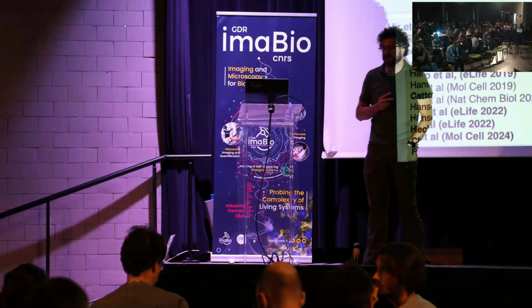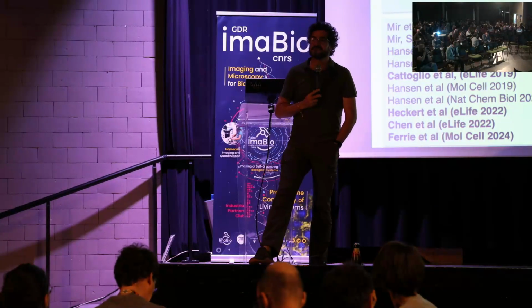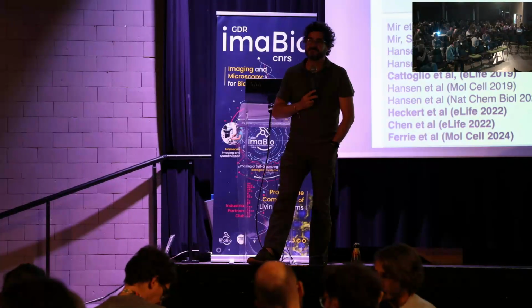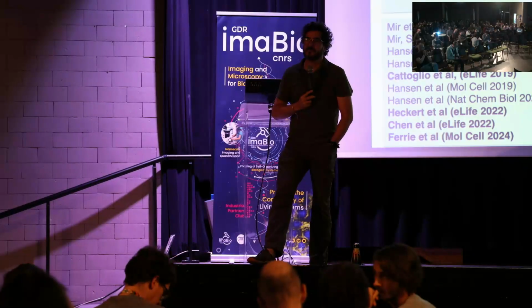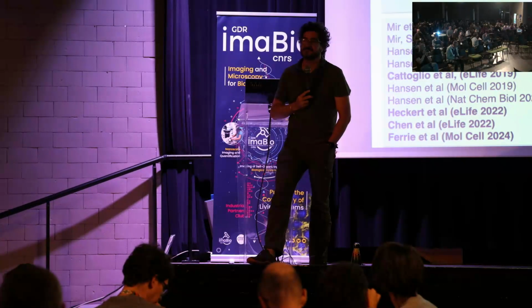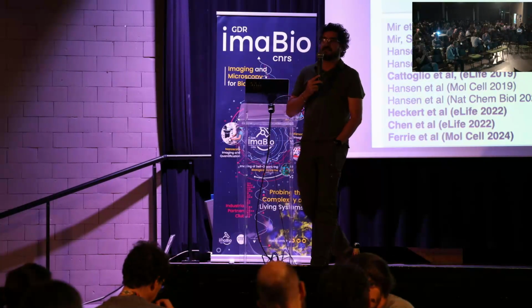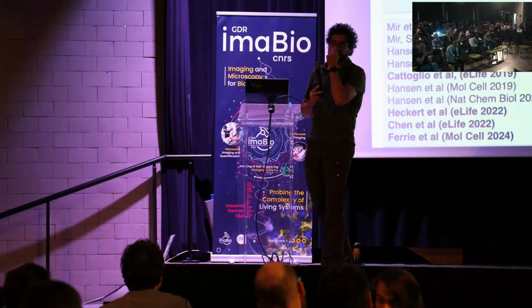So just to reiterate, if you have a red fluorophore, a red cyanine that's going into a dark state, you have a nearby green fluorophore, if you excite the green, you can cause the red to go back into a fluorescent state. And what we additionally saw is if you swap the green fluorophore for a blue or a violet, you can also recapitulate that interaction. So I think that you could actually apply that, you could have multiplexed detection in this way.